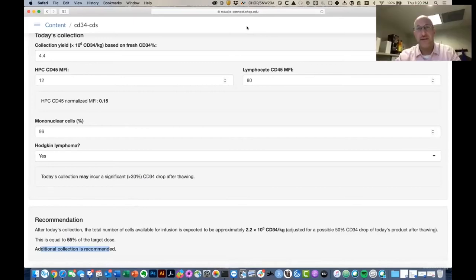Right. I think that's a great question, because I think the lab would oftentimes find out these kinds of things, and then you have kind of a gut feeling that this and this marker sometimes means that and that, but none of this is rigorous if you don't do it in a rigorous way. So we're going through a prospective validation of this model right now. Then of course the lab doesn't have the final decision of whether we recollect the patient.